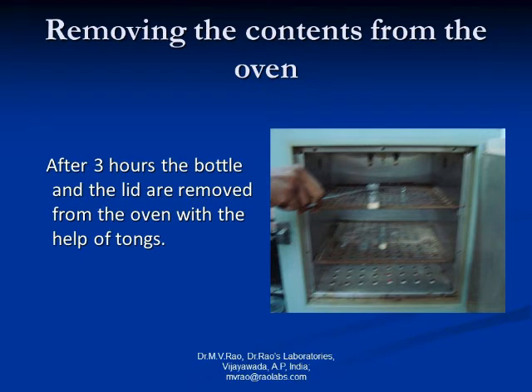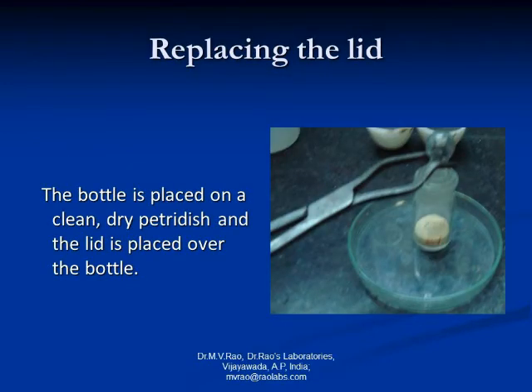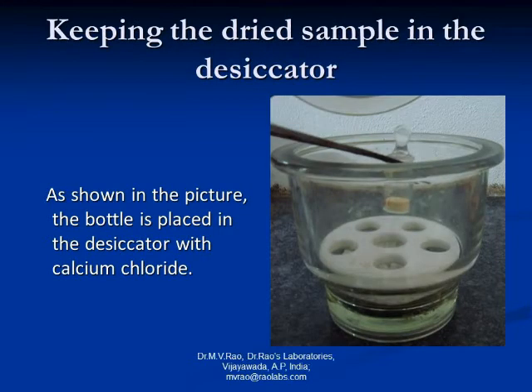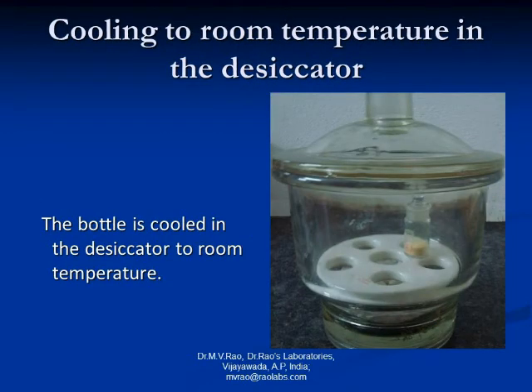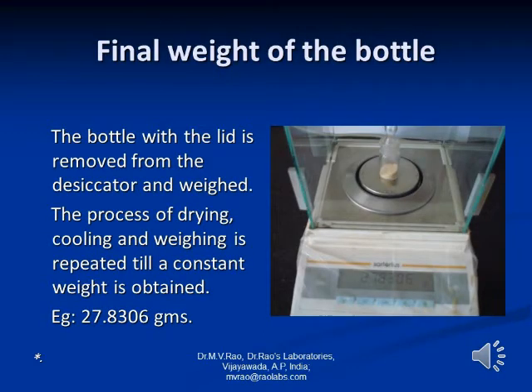After three hours of drying, the bottle and lid are removed from the oven with the help of tongs. The bottle is placed on a clean dry Petri dish and the lid is placed over the bottle. The bottle is then placed in the desiccator over calcium chloride and cooled to room temperature. The bottle with lid is removed from the desiccator and weighed. The process of drying, cooling and weighing is repeated till a constant weight is obtained. The final weight in this case is 27.8306 grams.